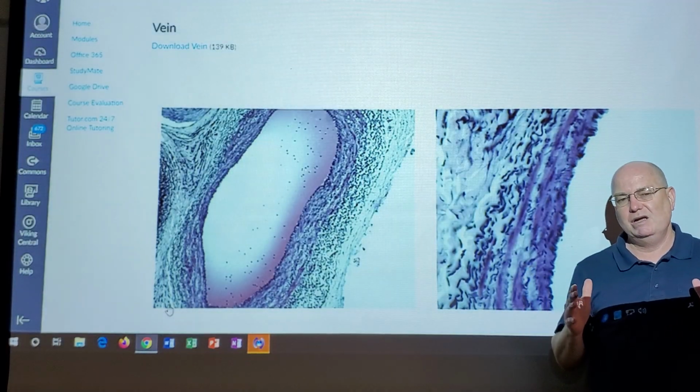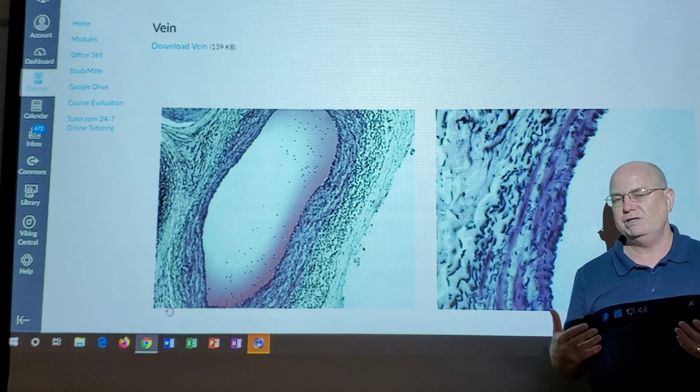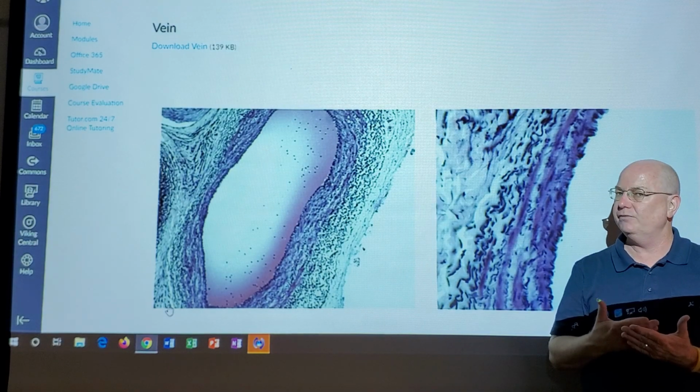Okay, listen. I hope that from the drawings that I made and from these slides, you're able to see what you're supposed to see and understand, and you can answer questions on the lab test. Now remember, this is not about learning for the lab test. This is about learning for your future.